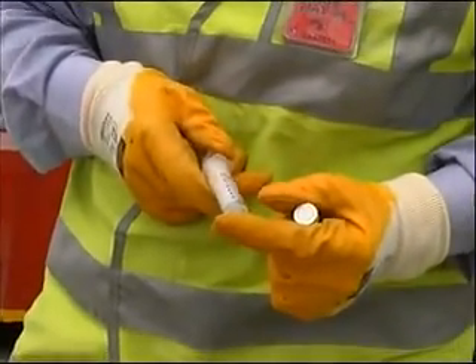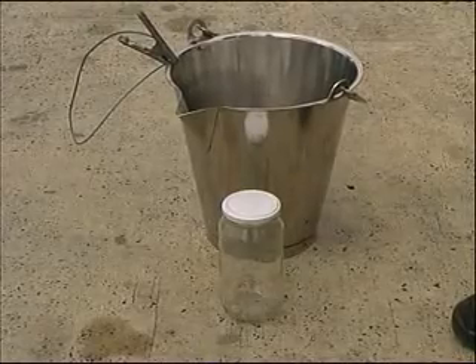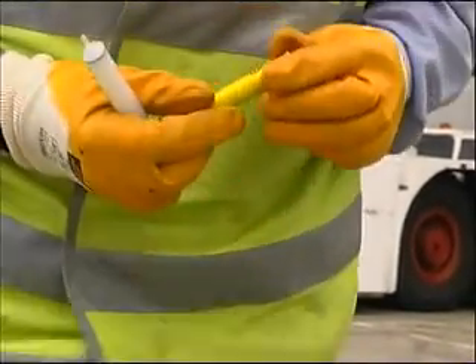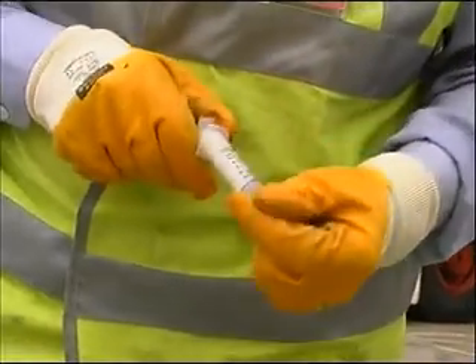Shell Water Detector Test Procedure. Step 1: Check the equipment. Detector capsule — examine the bottom of the tube to ensure the capsules have not passed their expiry date. 5 ml or 0.2 fluid ounce syringe.